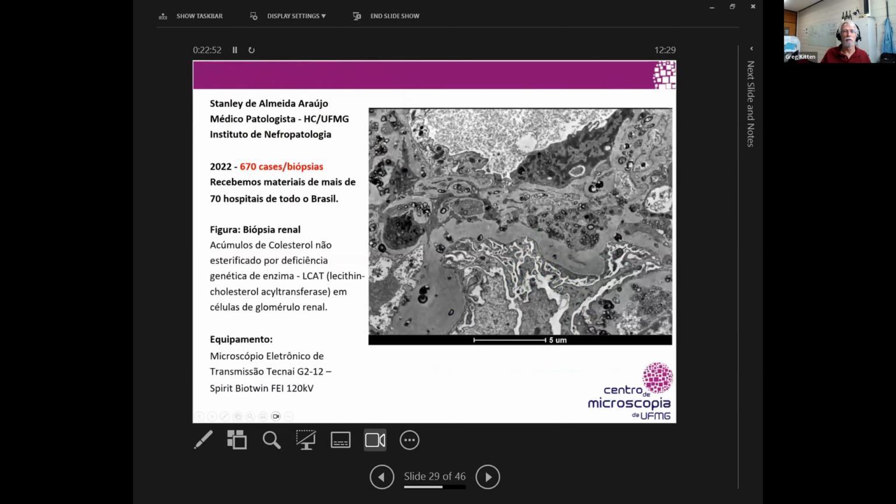I think this year we'll probably pass somewhere between 700 and 800 biopsies. This is a point I'll make now, but we'll come back to later. In this case, we were doing all of the preparation and all of the microscopy. Finally, we trained the people from this company to do this themselves.